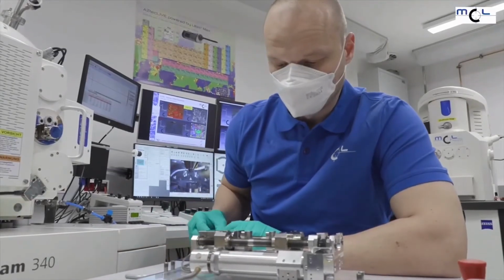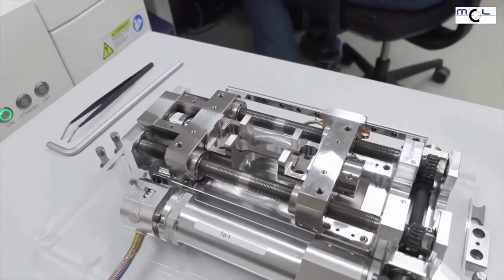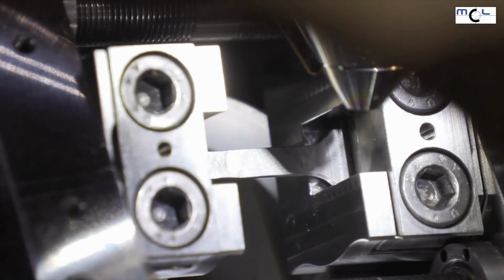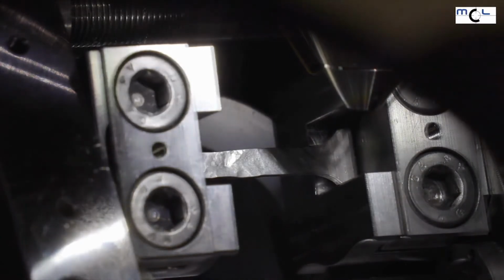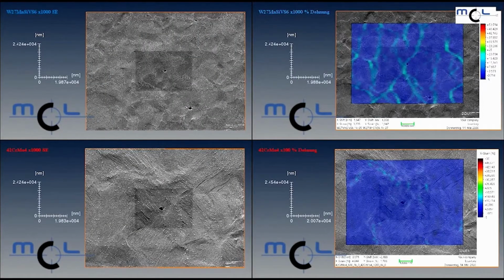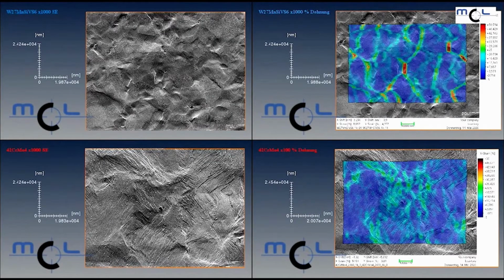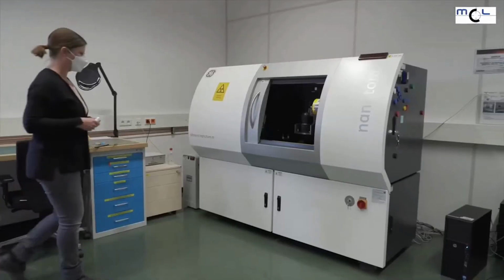A modular SEM allows us to integrate different modules such as tensile test unit, a nanoindentor, an atomic force microscope or a heating module. This allows us, for example, in situ studies of deformation phenomena or phase transformations. Currently, we are developing static and cyclic test methods with a nanoindentor to determine critical shear forces at interfaces or fracture mechanical properties of grain boundaries. With all this equipment, we are able to understand the properties of individual phase components and interfaces in order to incorporate them into the modeling of new materials.